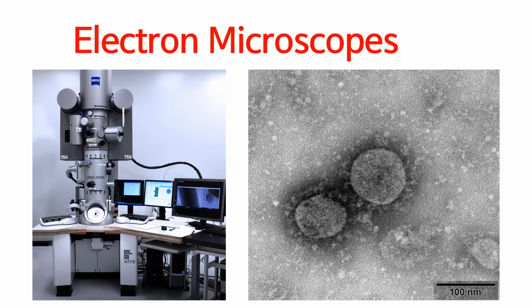The diffraction phenomenon of the wave restricts the resolution in observing an object. This resolution roughly corresponds to the electromagnetic wave's wavelength. The optical microscope uses visible light, and its highest resolution is 0.5 micrometers, which is the average wavelength of the visible light. Thus, the magnification of the optical microscope is about 2000.